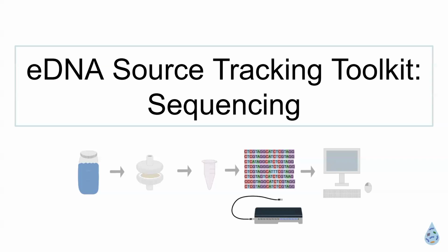The key is that we don't want to leave behind anything, and it's the same thing with the RNase spray you'll see for lab surfaces, which will also leave a residue behind. So if somebody does decide to use bleach in their own lab, rinse it with water, rinse it with ethanol, try to get rid of that bleach as much as possible.